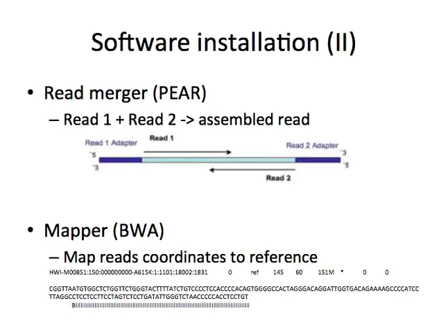So in order to carry out this project, I had to pre-install many different packages of software. The sequences that come from the sequencer always come in two sets, read 1 and read 2, because each cluster of DNA is read from one side and from the other. So we need to use a tool to merge the two reads. Since they both overlap, we can use some computational tools to merge them.